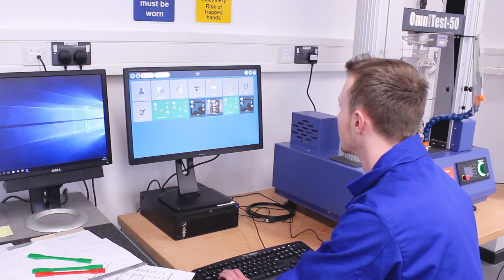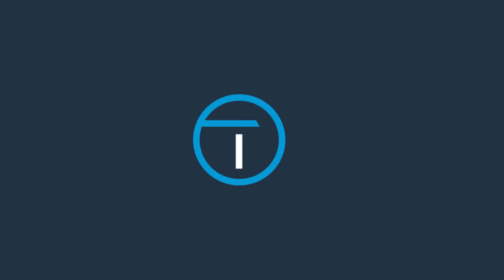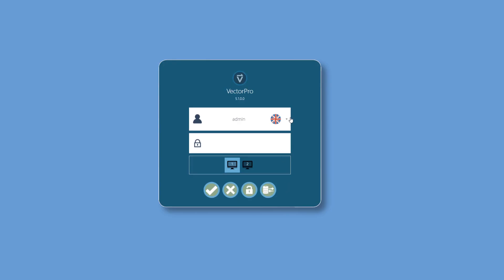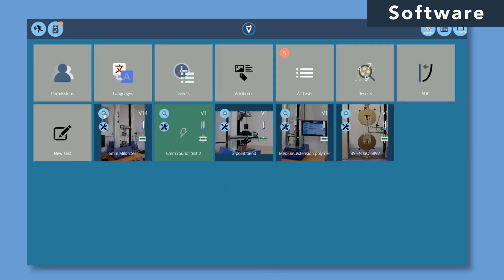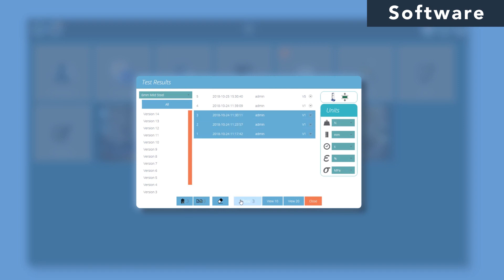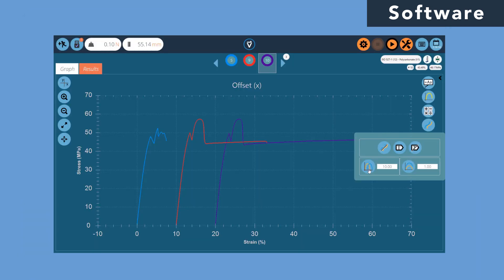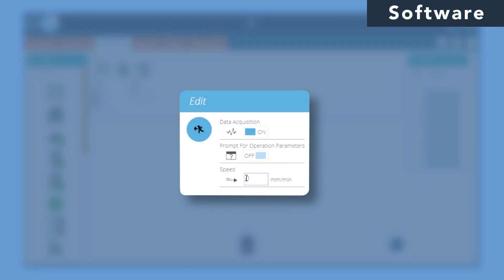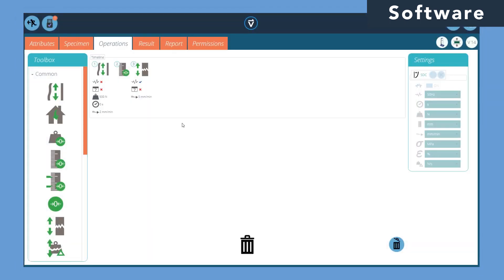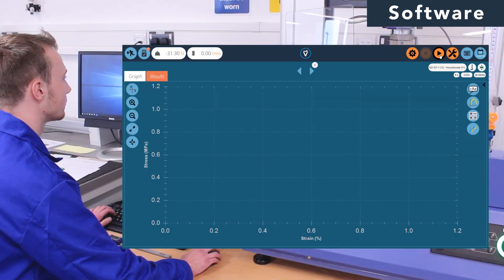At the heart of the OmniTest lies the control and acquisition software. Vector Pro MT has been designed to be purely intuitive, making it ideal for new or occasional users of varying skill levels. Its streamlined functionality keeps the workflow simple and the workspace uncluttered. Logically grouped icons quickly take the user through a step-by-step process to create even the most complex test routines, with the ability to refine as you go in a way that you want and in the language your operators understand.